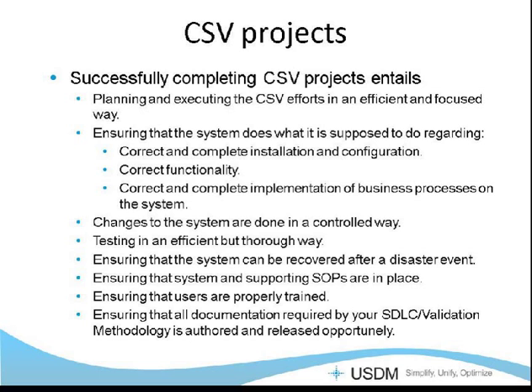We want to make sure that system and supporting standard operating procedures are in place. We want to make sure our users are trained, and we want to make sure that the documentation is authored and released opportunely in a flowing manner, in the correct manner, that we're limiting the approvers to those people who have the knowledge to approve them, and that we're doing this efficiently.